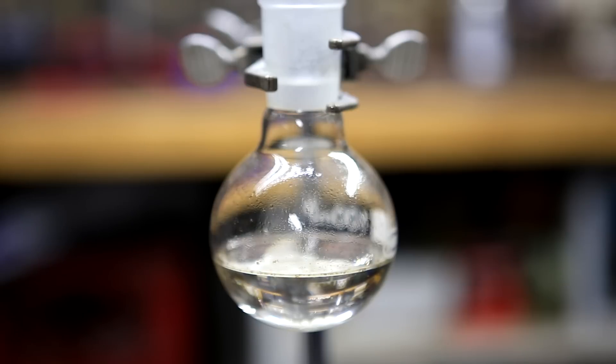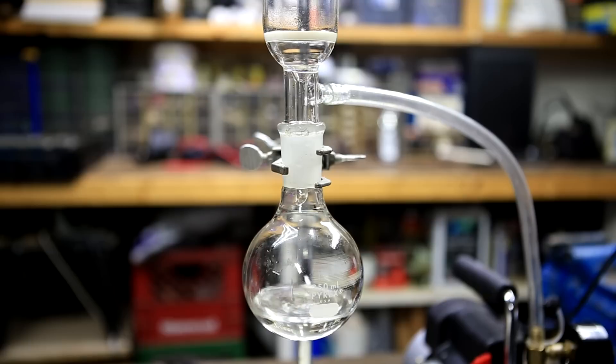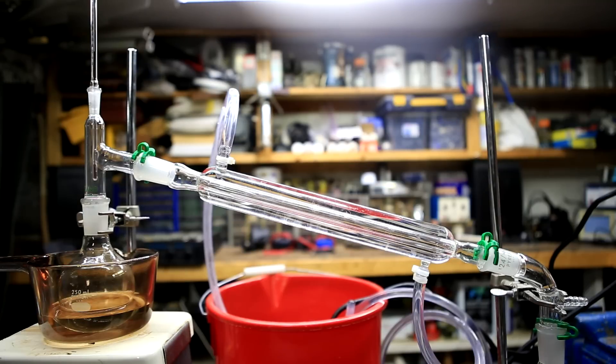The organic layer was dried using calcium chloride and then filtered into a round bottom flask. The filter was washed with a small amount of DCM. A distillation was set up to remove and recover the dichloromethane, and at the bottom of the round bottom flask we are left with some dry crude caffeine.